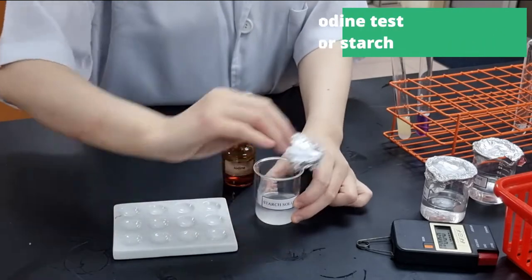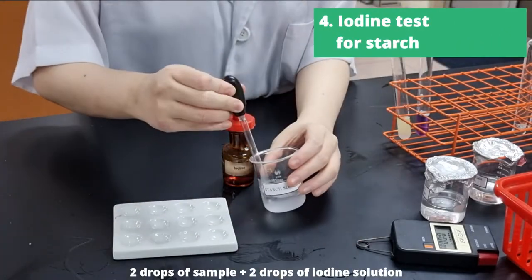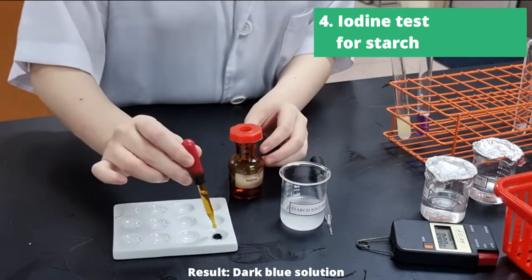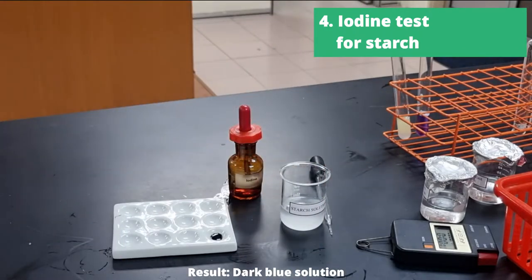The next test we'll be doing is the iodine test for starch. This is the easiest test ever. Add 2 drops of sample to 2 drops of iodine solution, and your result will be a dark blue solution.